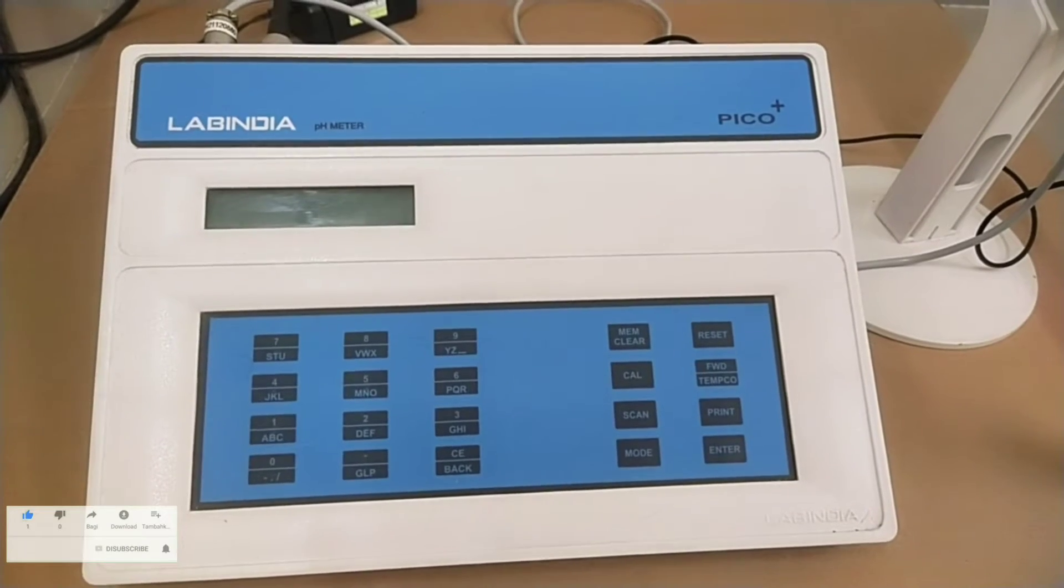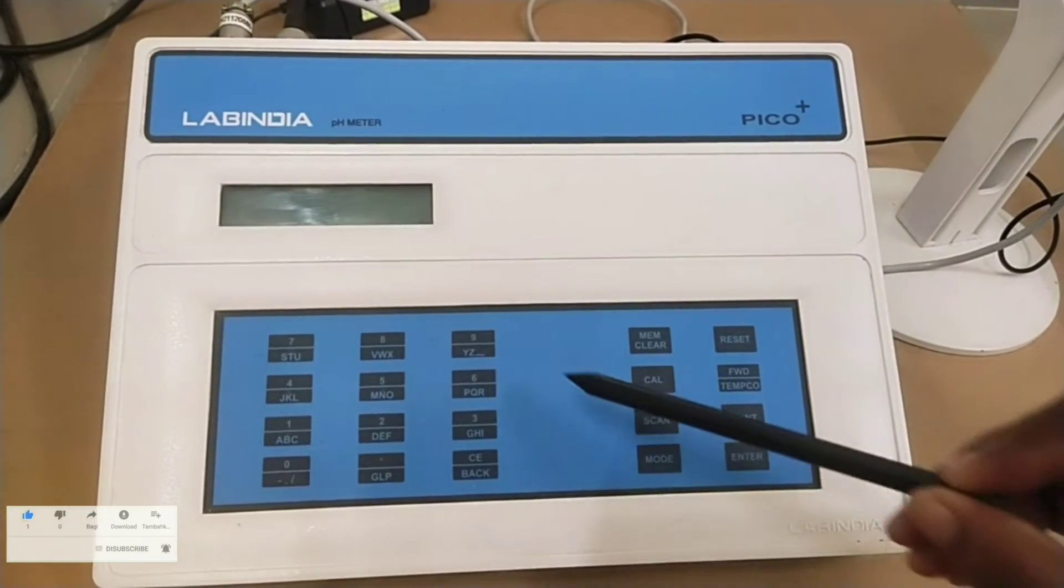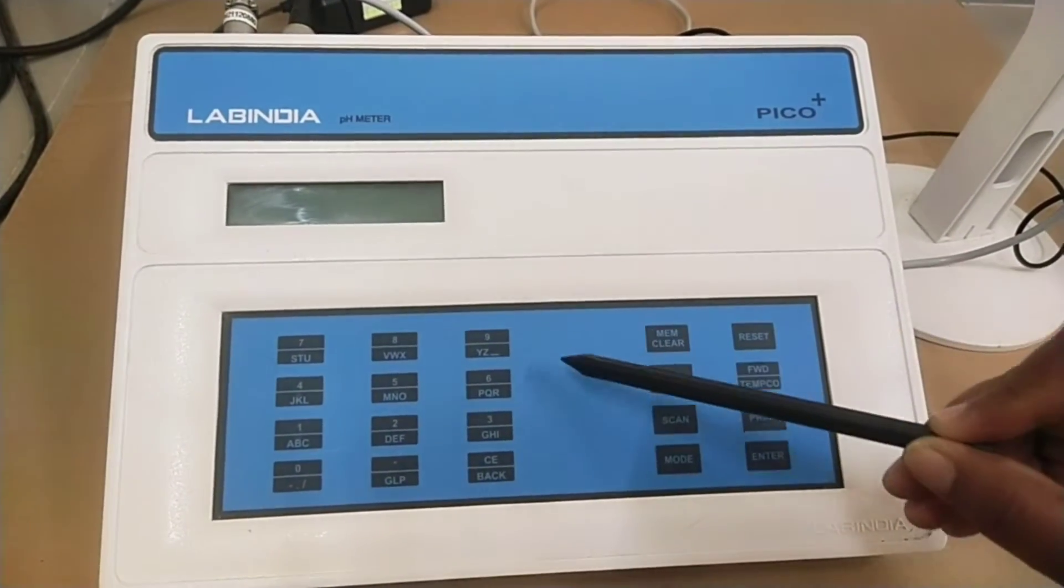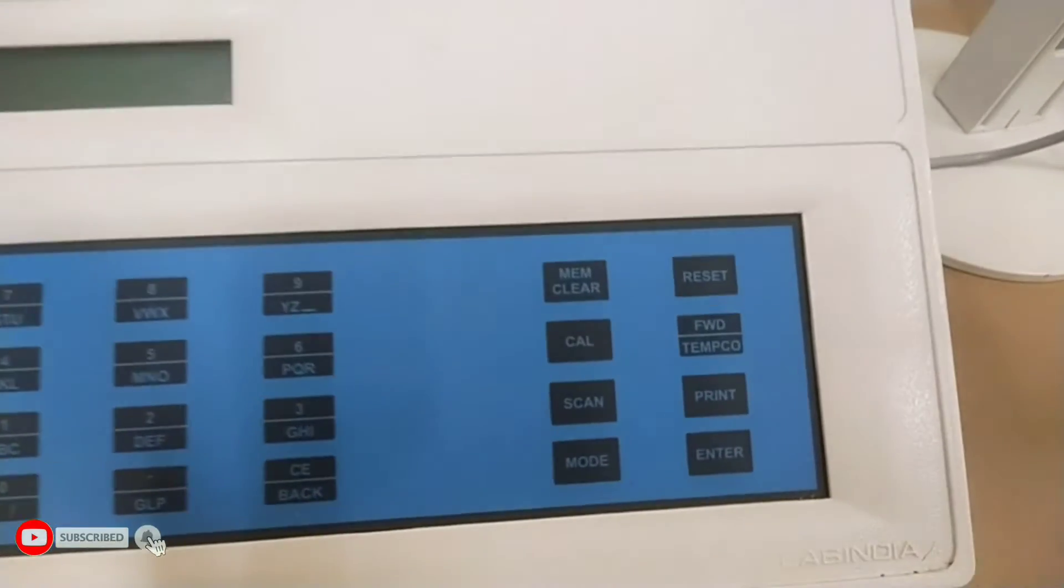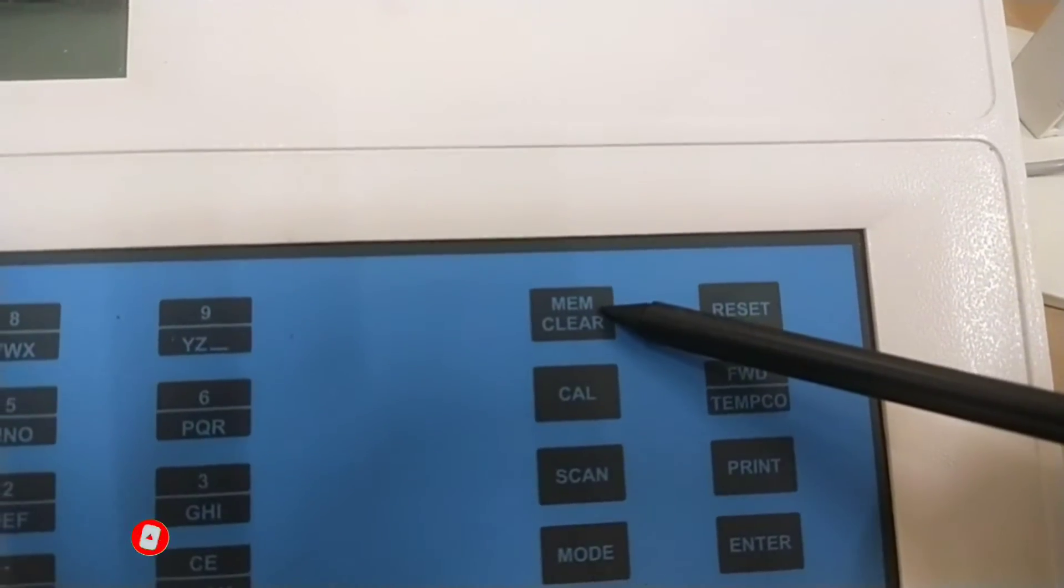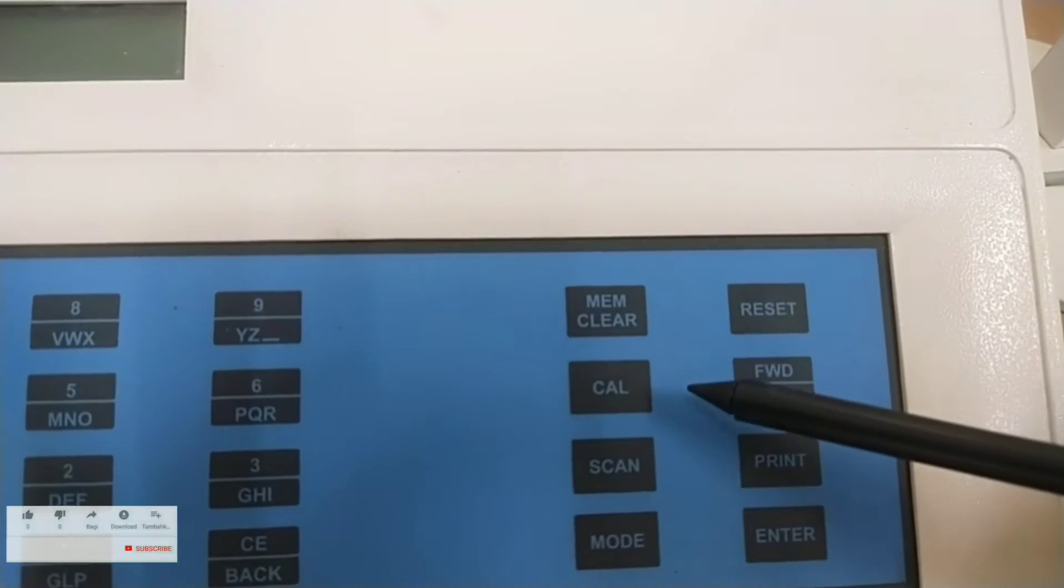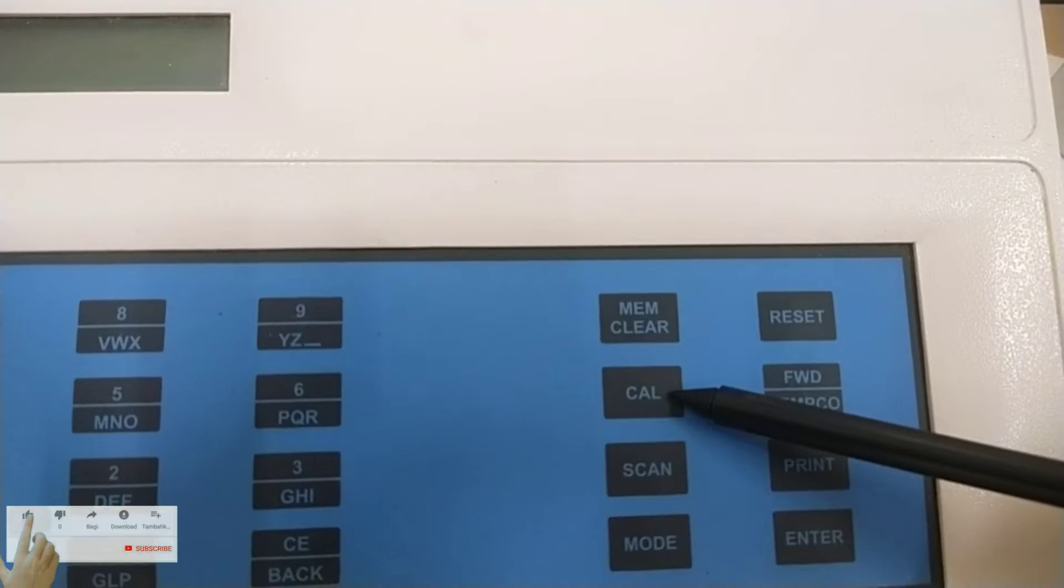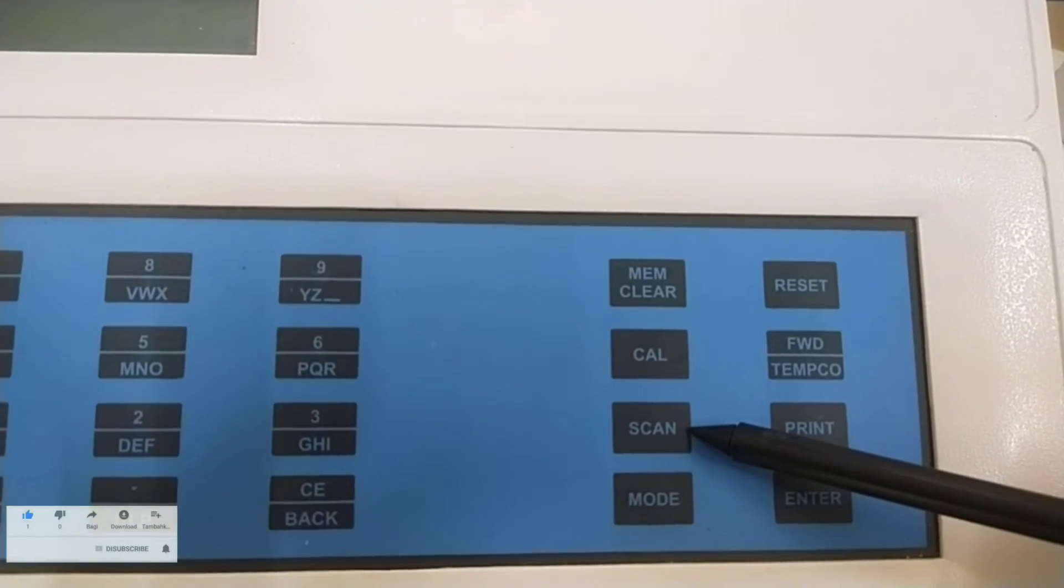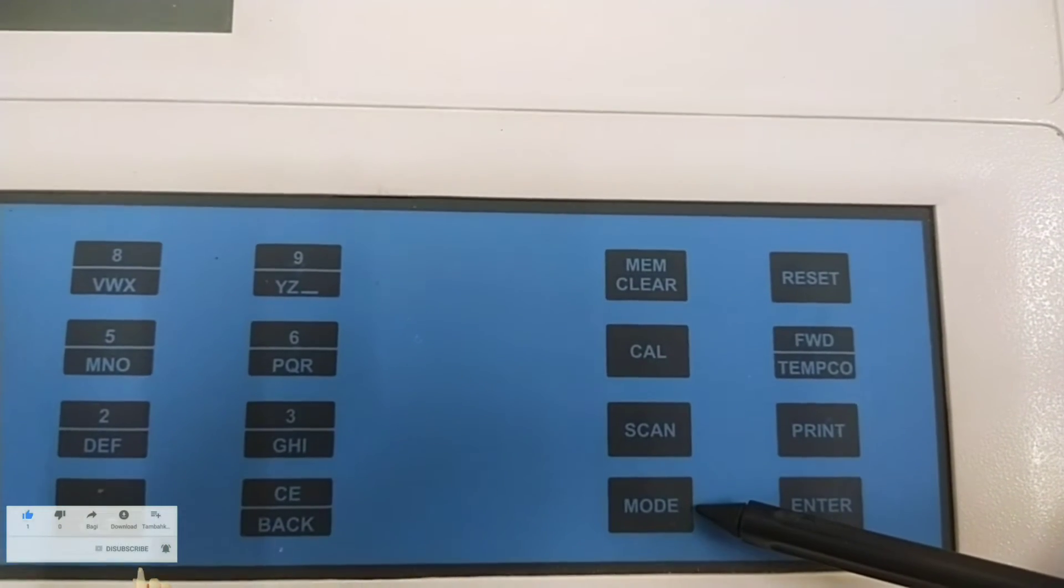It is front panel keyboard. Left hand side alpha numeric keys. Right hand side functional keys. MEM clear key to clear the stored readings. Call key to perform calibration within the standard operating mode. Scan key to scan or read the stored readings. Mode key to select meter operating code.